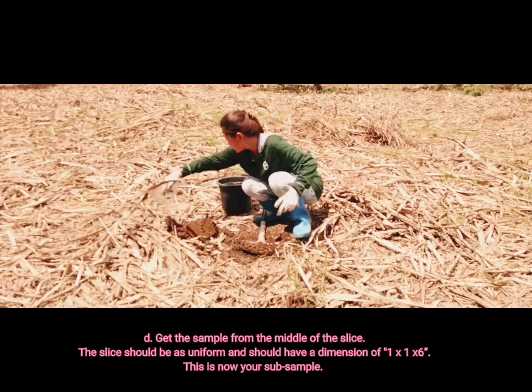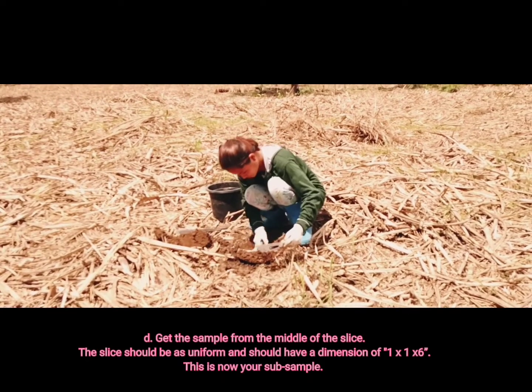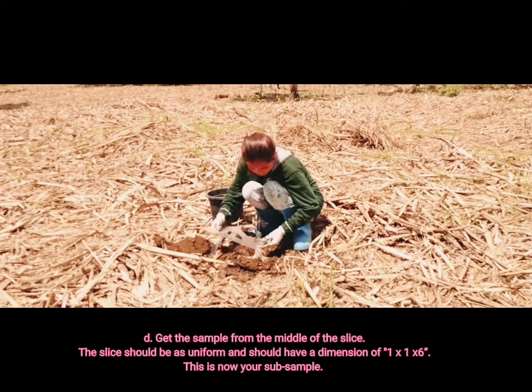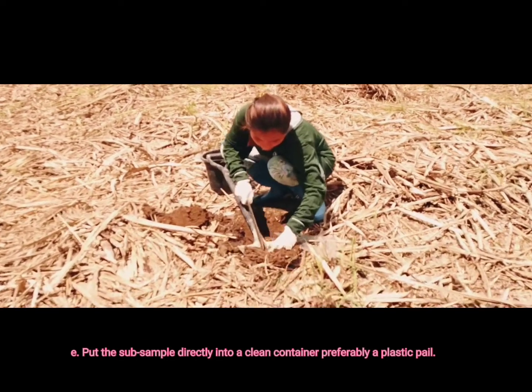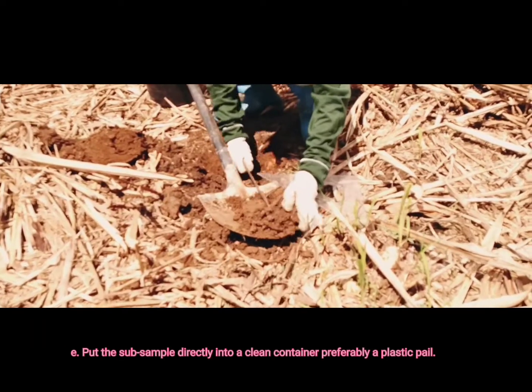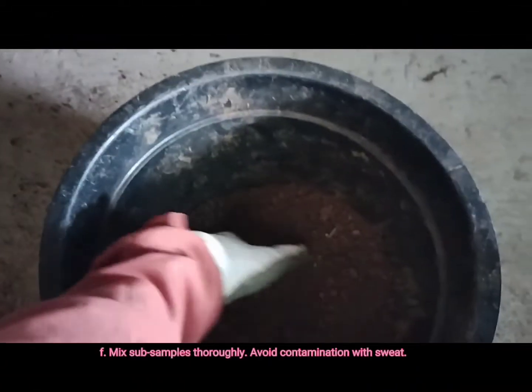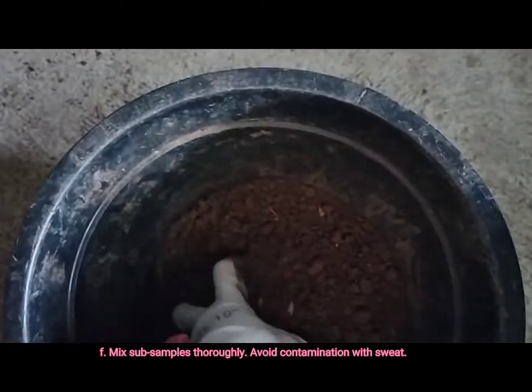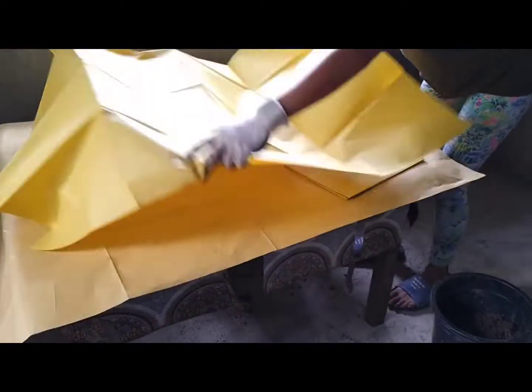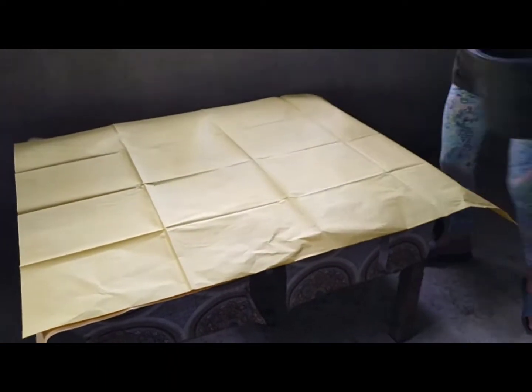The slice should be uniform and should have a dimension of 1 by 1 by 6. This is now your subsample. E. Put the subsample directly into a clean container, preferably a plastic pail. And last, mix subsamples thoroughly. Avoid contamination with sweat.